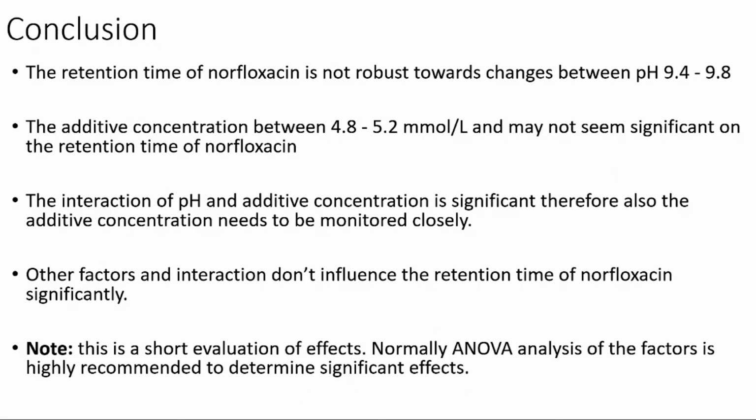But to sum this up, we have learned now that the retention time of norfloxacin is not robust towards changes of pH value between 9.4 and 9.8. This became clear from looking only at the main effects. From the table at the start, it also looked like the additive concentration between 4.8 and 5.2 millimoles had no real influence on the retention time.